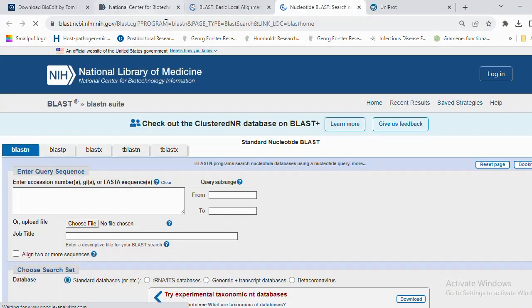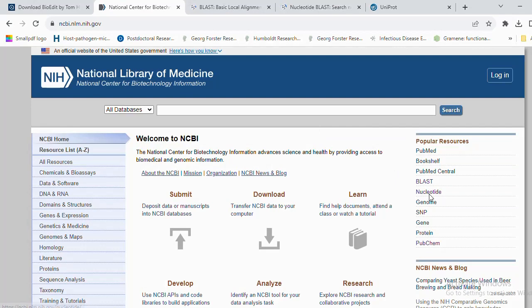If we are looking for BLAST, the Basic Local Alignment Search Tool, we use it to search the existing database, to compare our sequence with others and know which organism or which gene our sequence is related to, giving us some basic information.